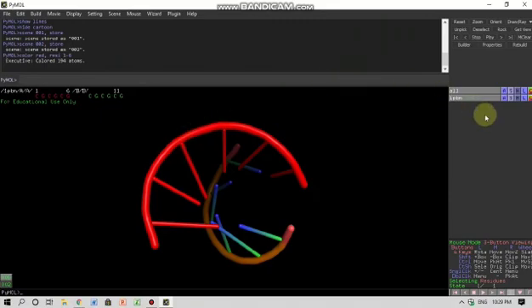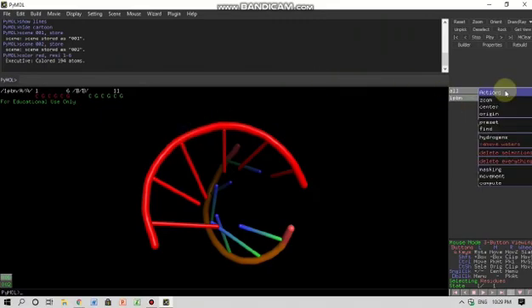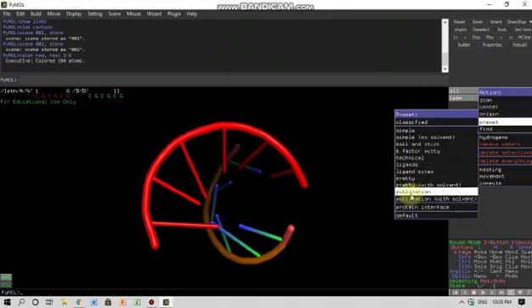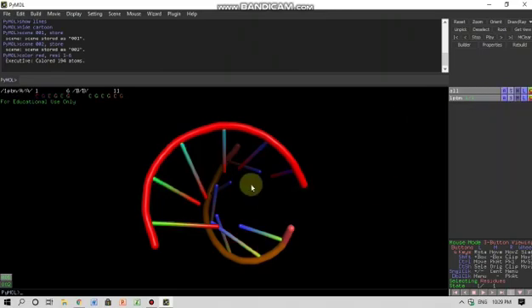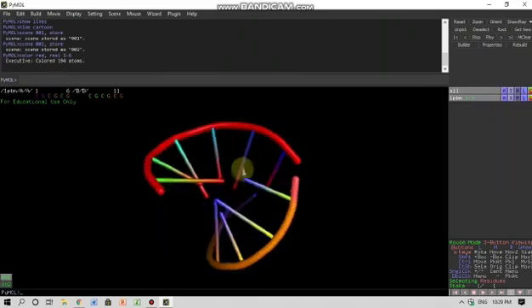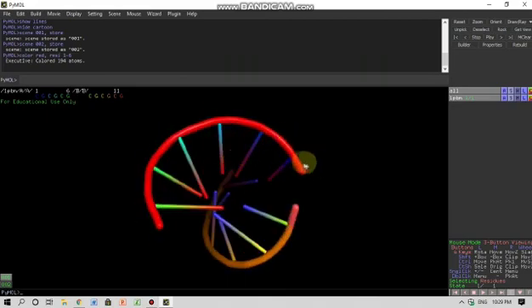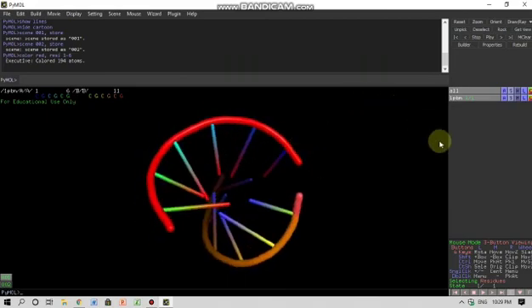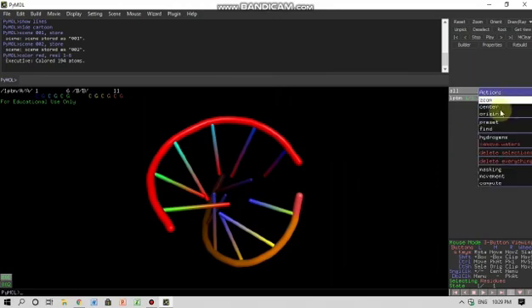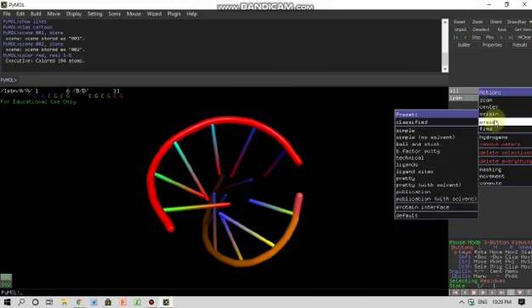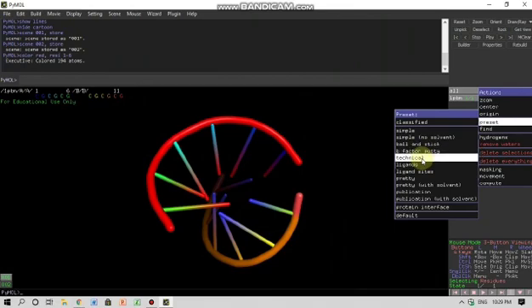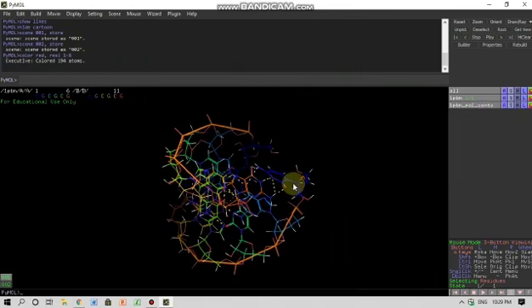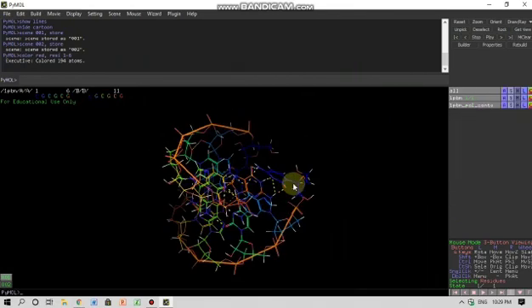And if I don't want to see it like this and I want to see it in the publication style, I can go here in the action and I can search for preset and I can click on publication. So this is the way one wants to see the protein structure or the other small molecule structure in the publications. Now you can also preset it to technical, whatever you want. Oh wow, so I can save this scene as well. Scene 003 store, enter. So yes.